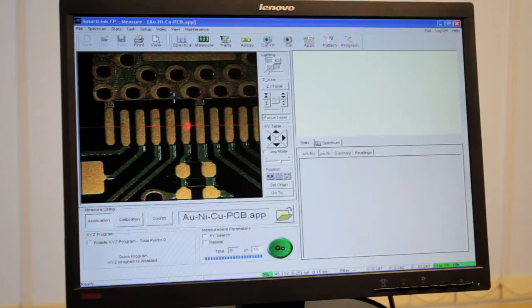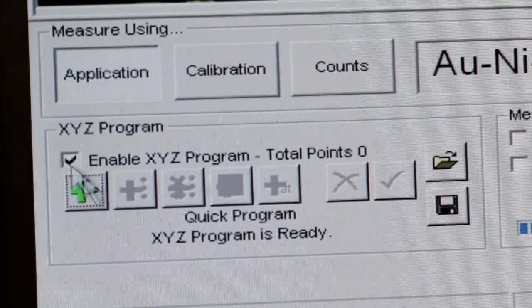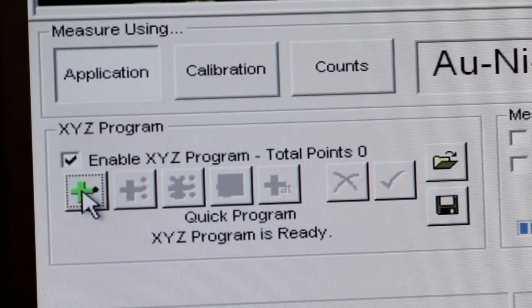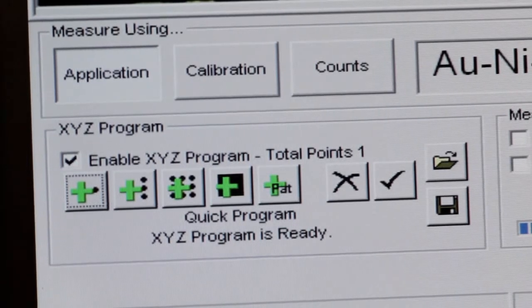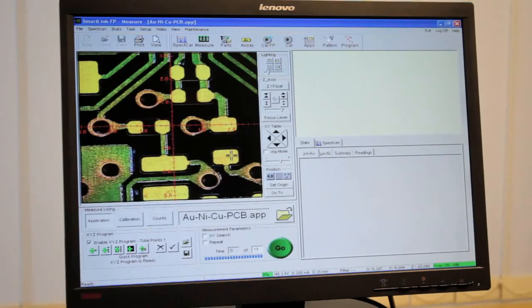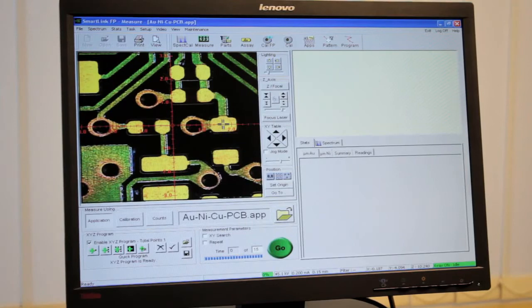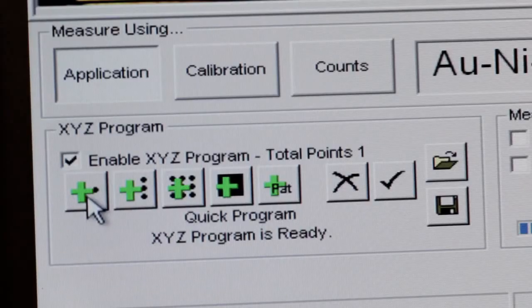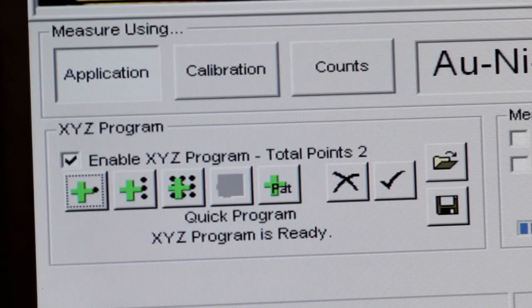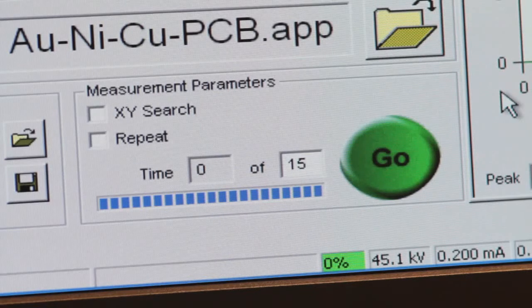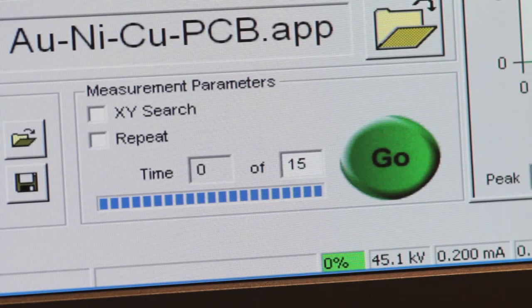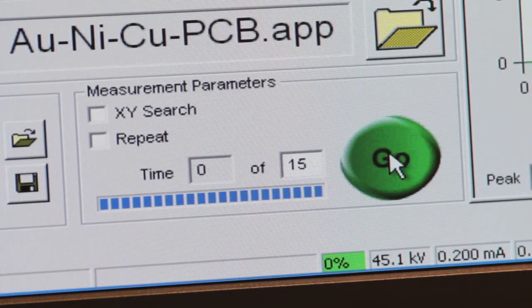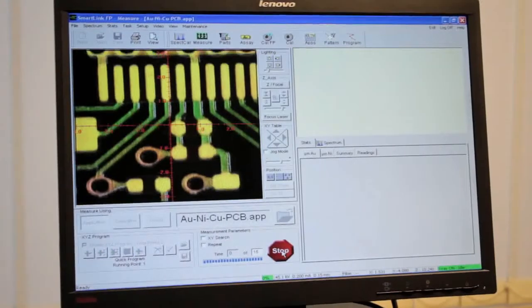To set up a series of measurement points on the sample to check coating uniformity, add the first measurement point by clicking on the XYZ program button. Using the motorized table, simply move the sample to the second analysis point and add the measurement point to the sequence. When all measurement points have been defined, simply press go to start the analysis.